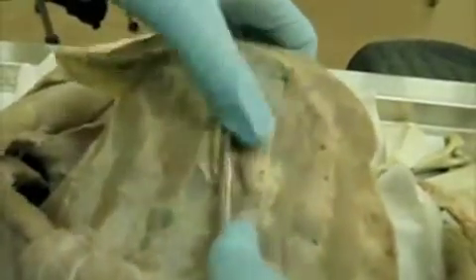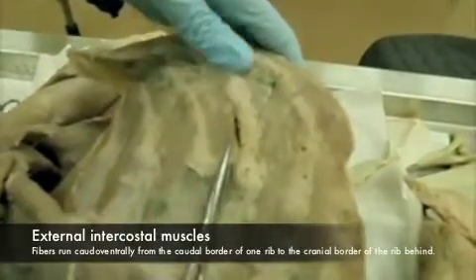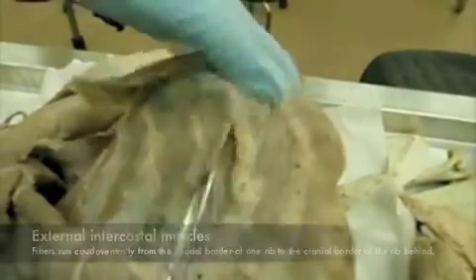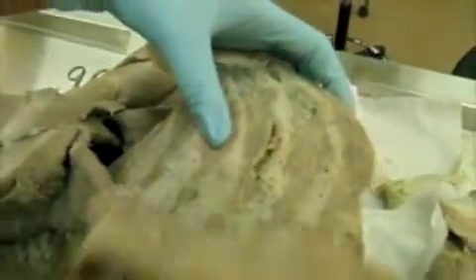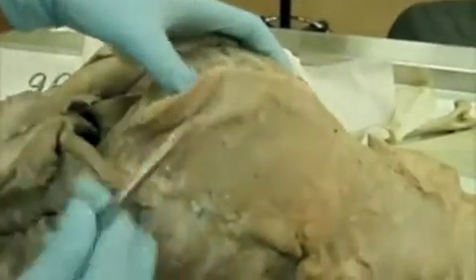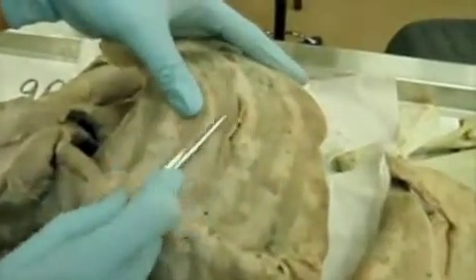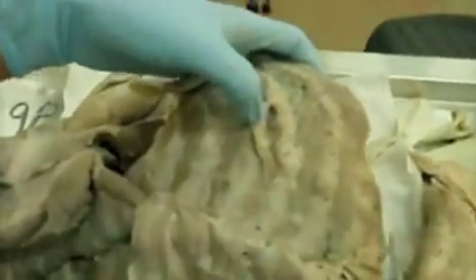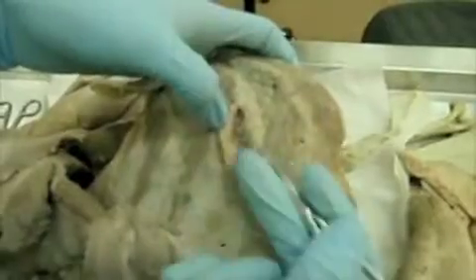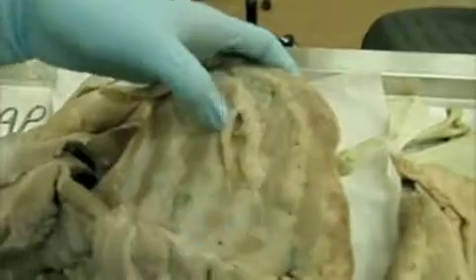Here we have the external intercostal, and underneath the internal intercostal. The external intercostals have the same direction of fibers as the external abdominal oblique. Like I said, this is caudoventral, and so do the external intercostals. If we look at the internal intercostals, they actually run the other way. They run cranioventrally. Okay, caudoventrally, cranioventrally. These are muscles of inspiration.